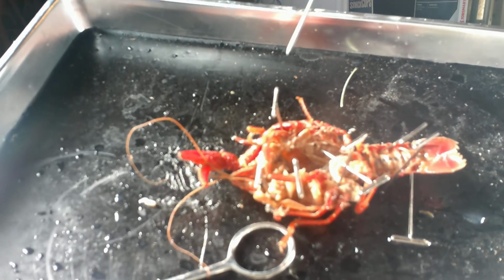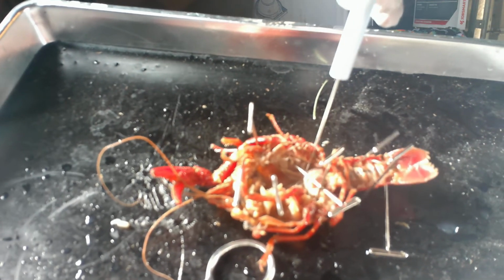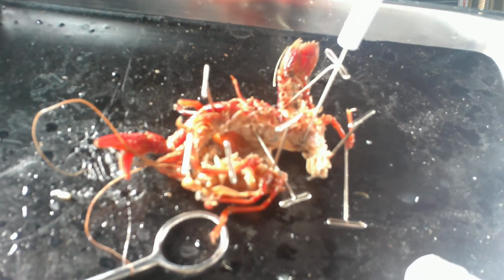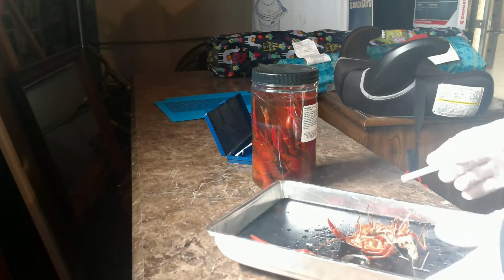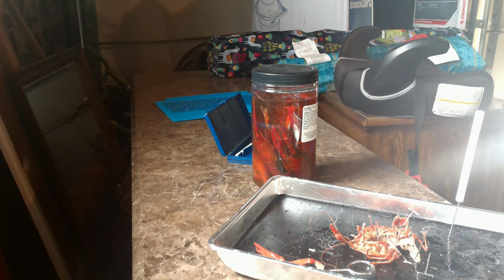And then the last thing that I wanted to show you guys is the liver. The liver is actually all the way back here, right there. This long linear piece right here is actually the liver. A little bit different than what we saw on the mollusk, which had a pretty decent size kidney, or an oversized kidney. So that is our basic anatomy for our crawfish.